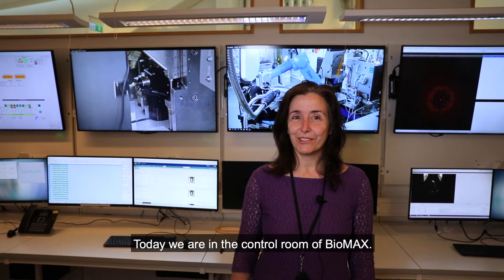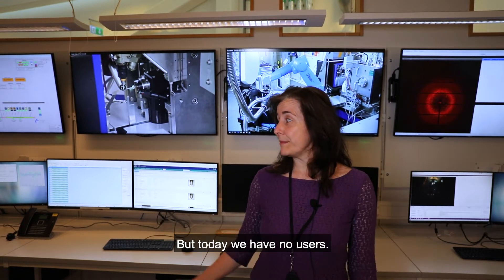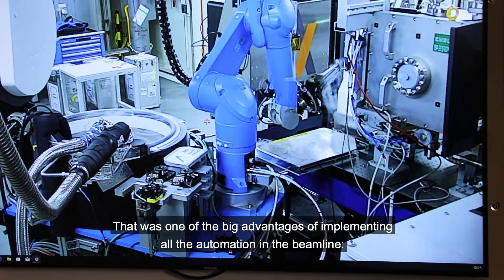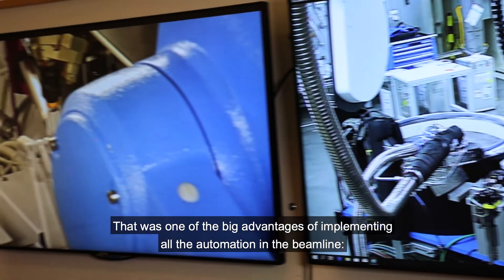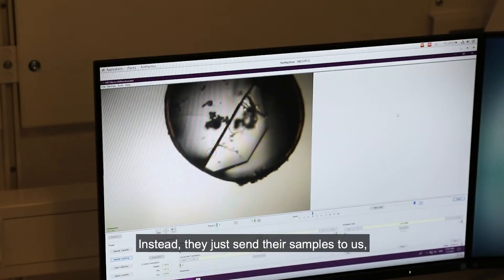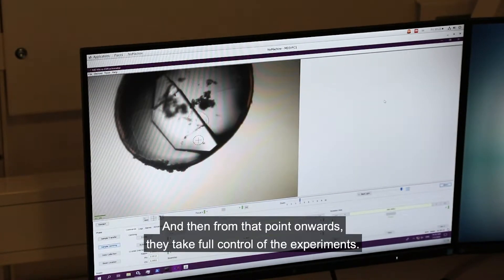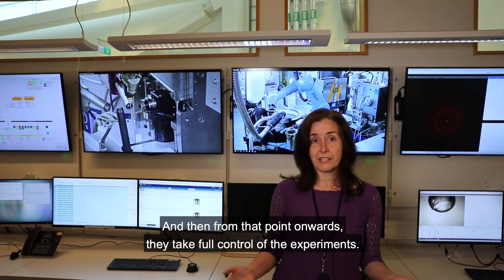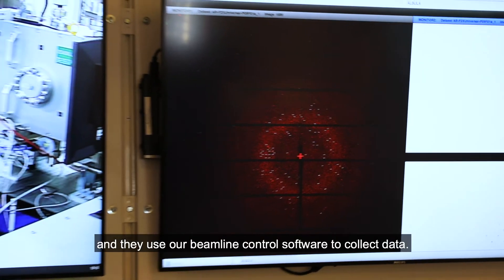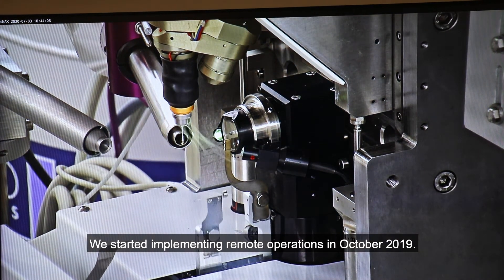Today we are in the control room of Biomax. This is the place where the users typically run their experiment from. But today we have no users — they are actually collecting data from home. That was one of the big advantages of implementing all the automation in the beamline: the users do not actually need to come to MAX IV to collect data. Instead, they just send their samples to us, we load them in the robot dewar, and from that point onwards they take full control of the experiment, logging in to our computers remotely from home or from work and using our beamline control software to collect data. We started implementing remote operations in October 2019.